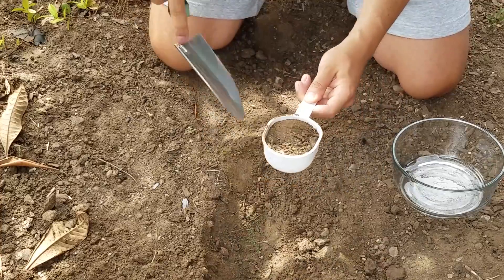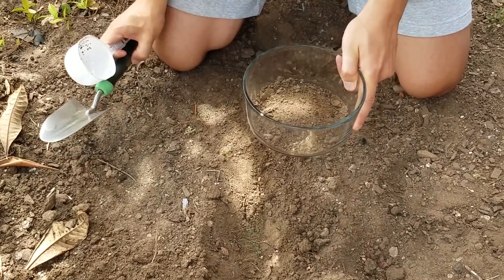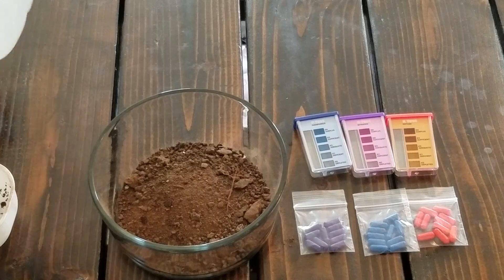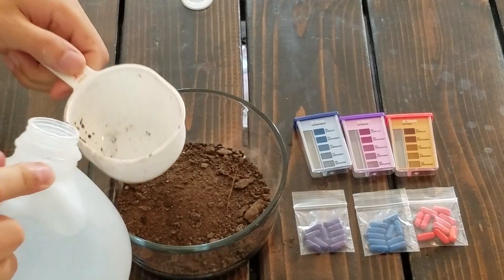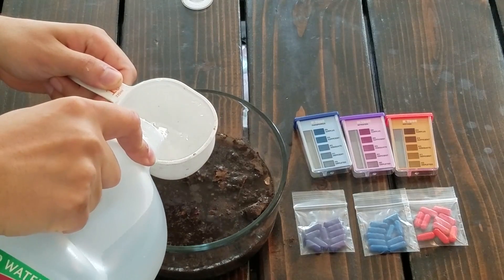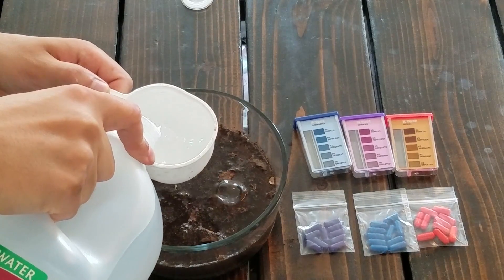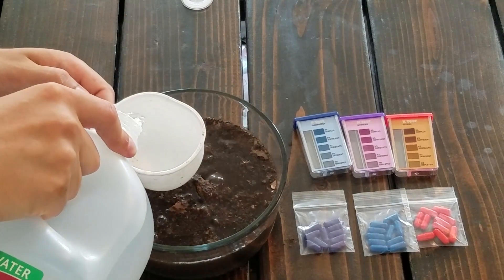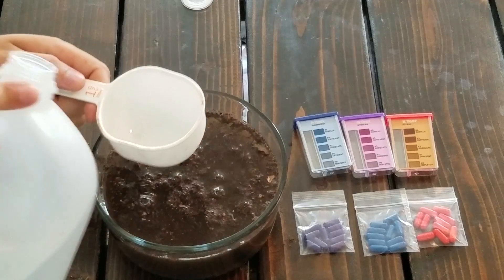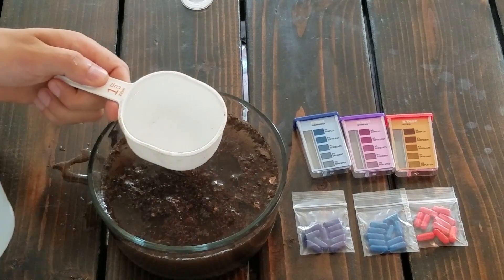Now we're going to hop back inside and fill this cup up with water as well. The Rapitest calls for one cup of soil to five cups of water, so let's go ahead and get that done. After we fill this up with water, we have to let it sit for at least a few minutes. I'll take a time-lapse to show you the settling process, but we need to cover this up, give it a good shake, and then let it settle — we definitely need the sediment to get to the bottom.